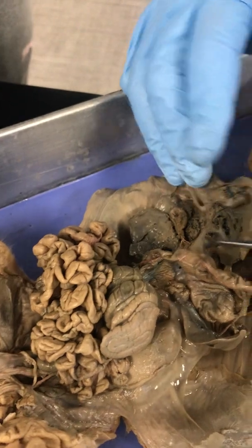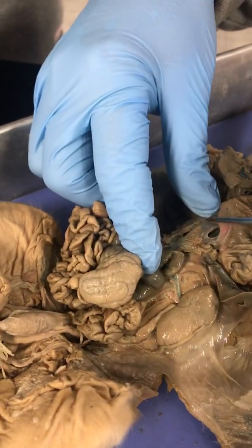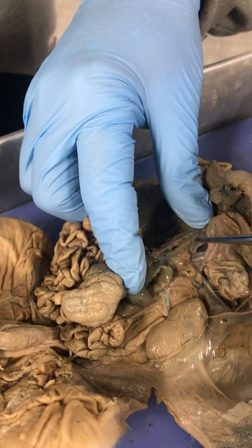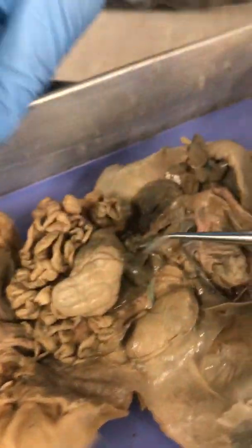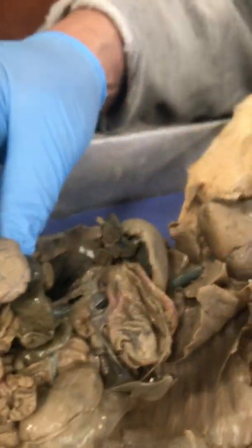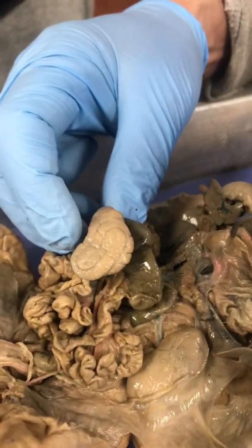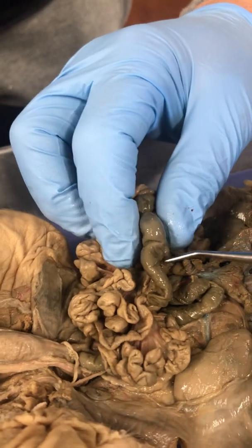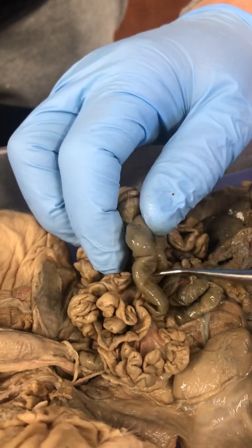If this is the duodenum, then you can see this kind of diffuse mass right there. What is that? The pancreas. That is the pancreas right there. And then if we go down, right here, that's the spiral colon, or the large intestine equivalent. Can we call that the pig's spiral colon? You can, or just tell me it's the large intestine, that's all right.